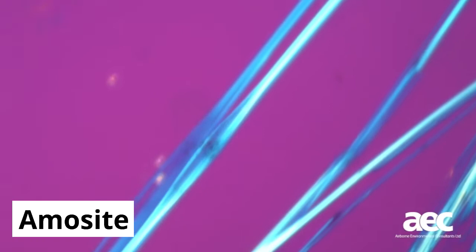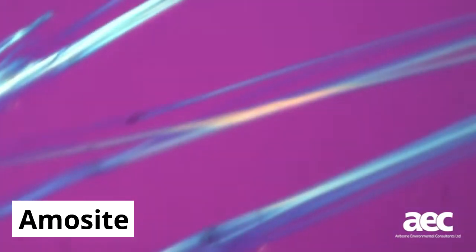This next test confirms whether light passes faster down the length of the fibre or across its width. We observe the orientation of the fibre when it is showing as a blue colour. This is referred to as the sign of elongation.